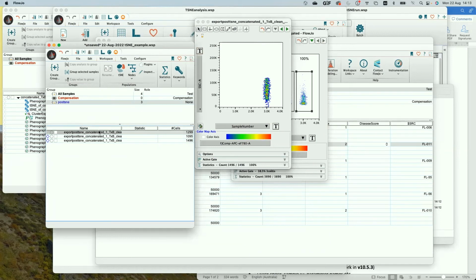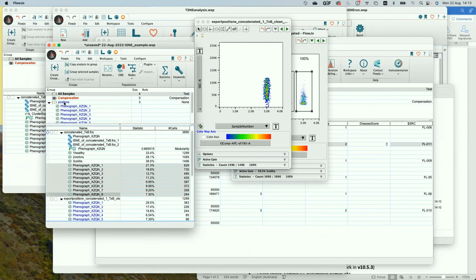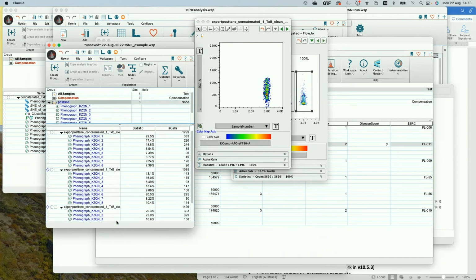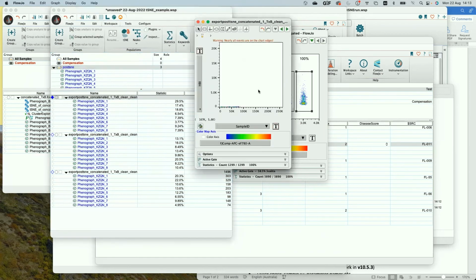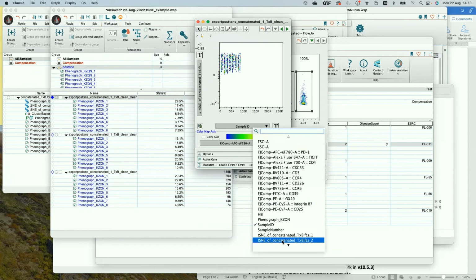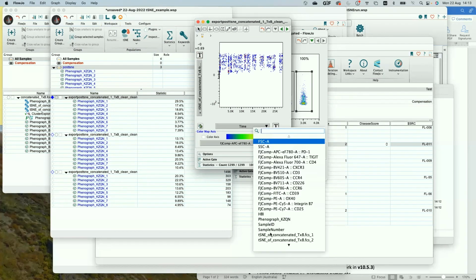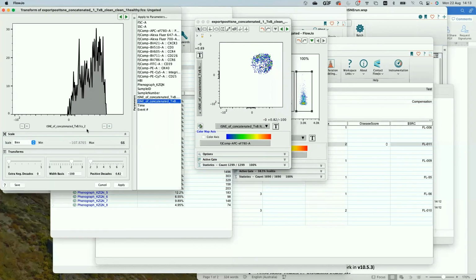And then once you've got these over here, all these populations that we predefined, you can now just drag and drop them, and it treats them like grouped analyses. Then you open this up, and I'm going to do the tSNE gates on here, not time, tSNE. Sometimes it does this, and you just have to customize the axis.